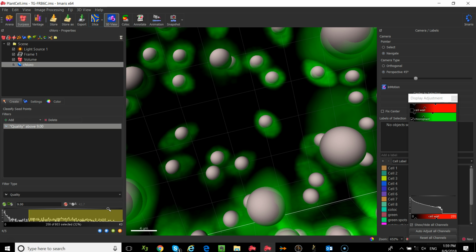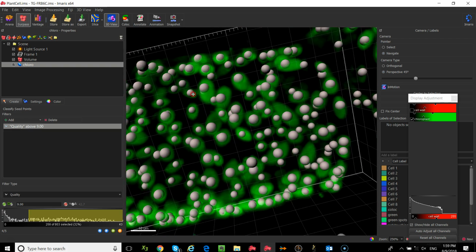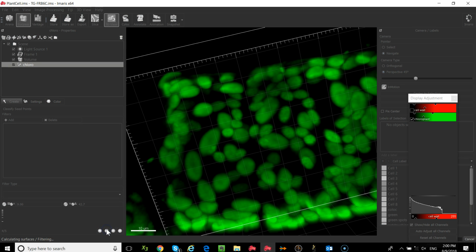Okay. Now, one other thing I'm going to tell you, there could be an instance where, I can't see any, but maybe you guys do, you see 2 spheres in one object and they're overlapping. Okay? Don't worry. That happens. You can have multiple peaks inside one cell. If they are overlapping, it will see them as one structure, so it won't split. Okay, so I'm going to go ahead and go to the next step.